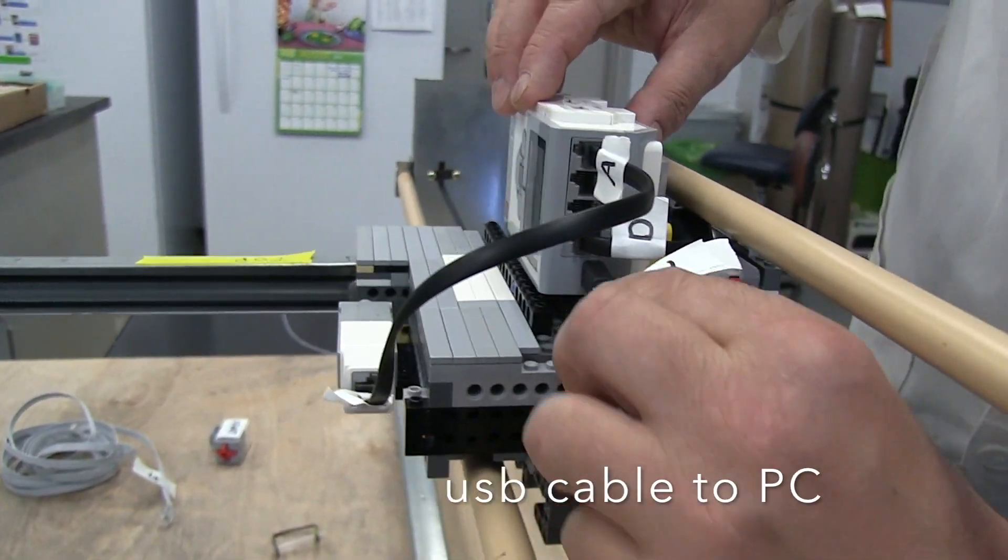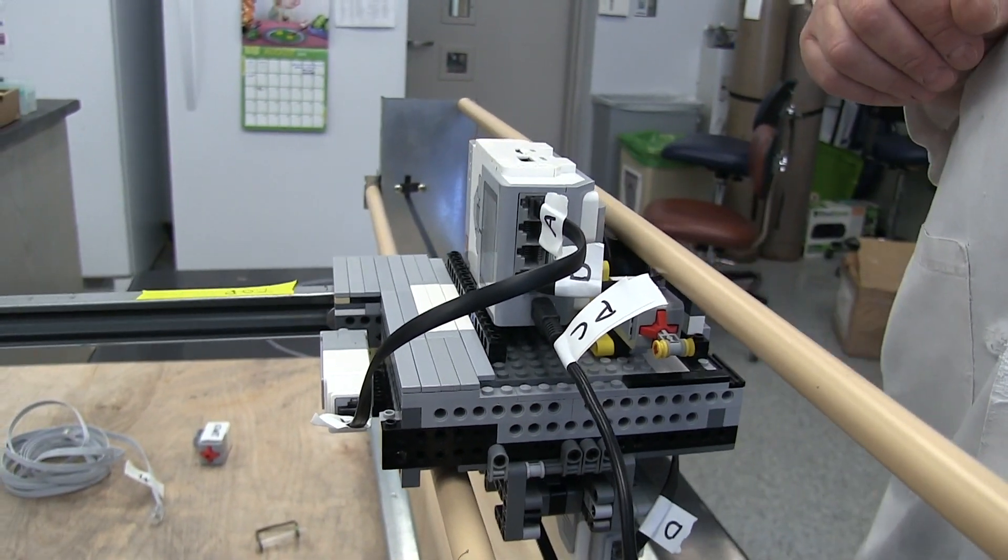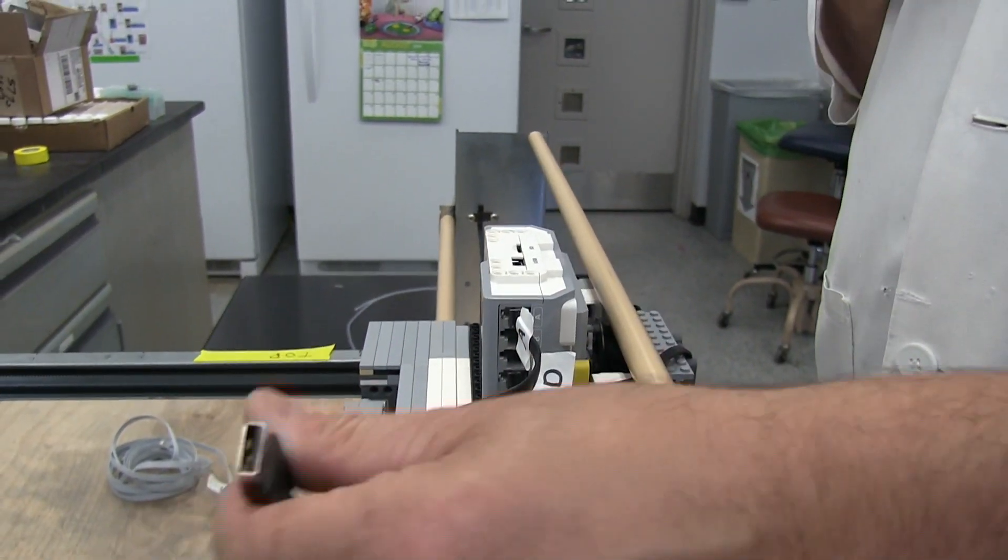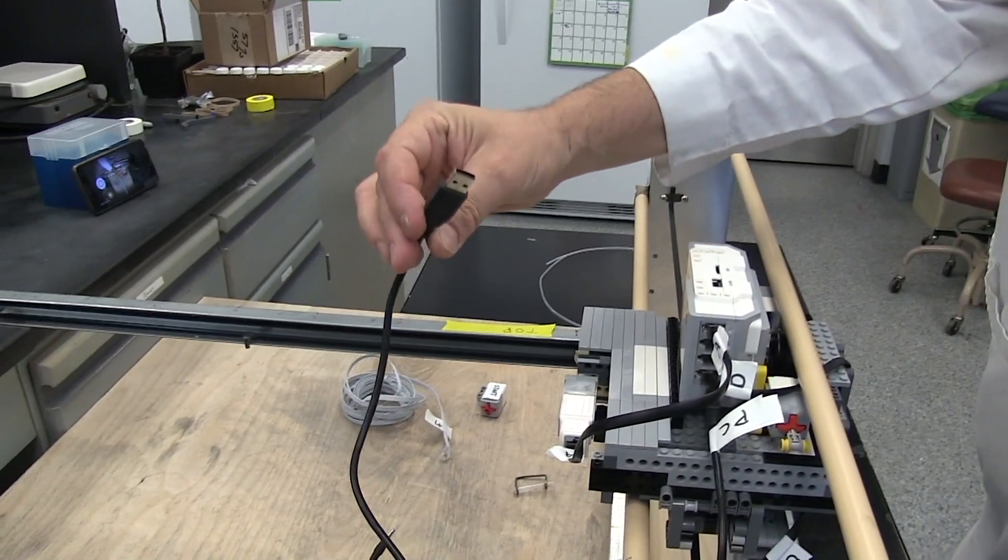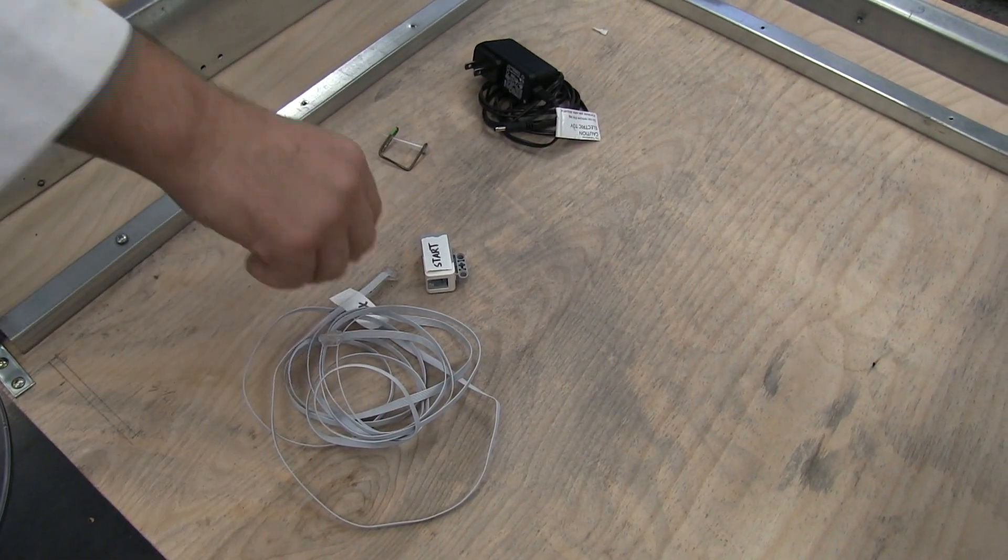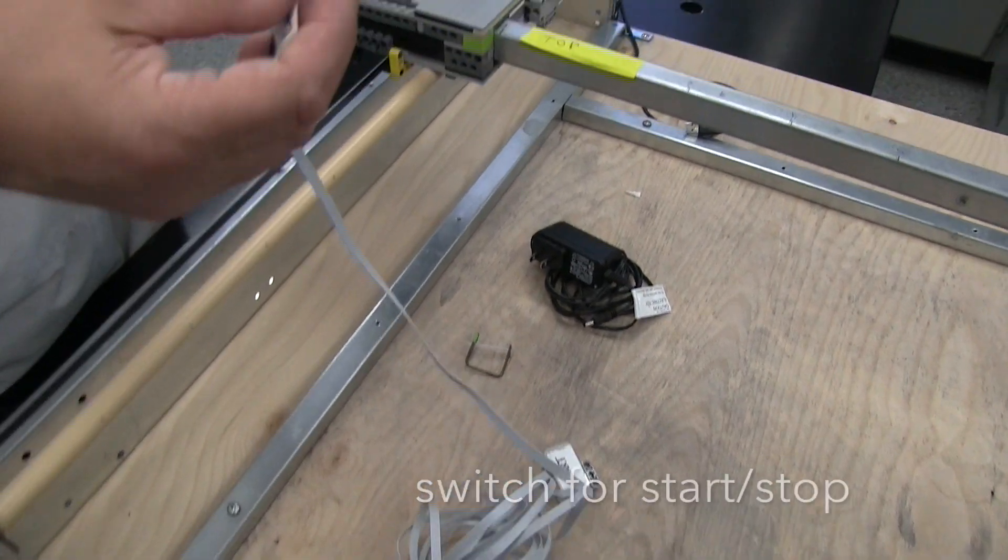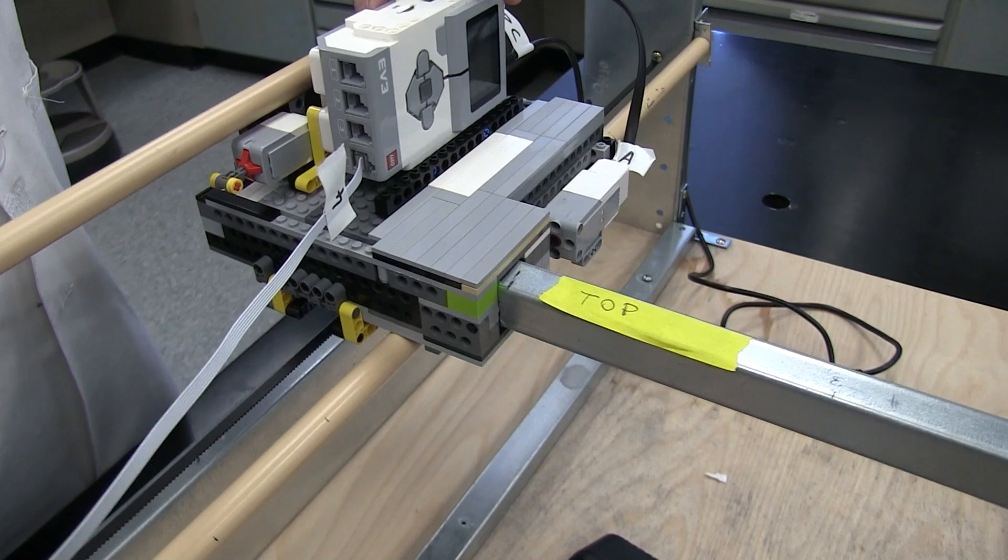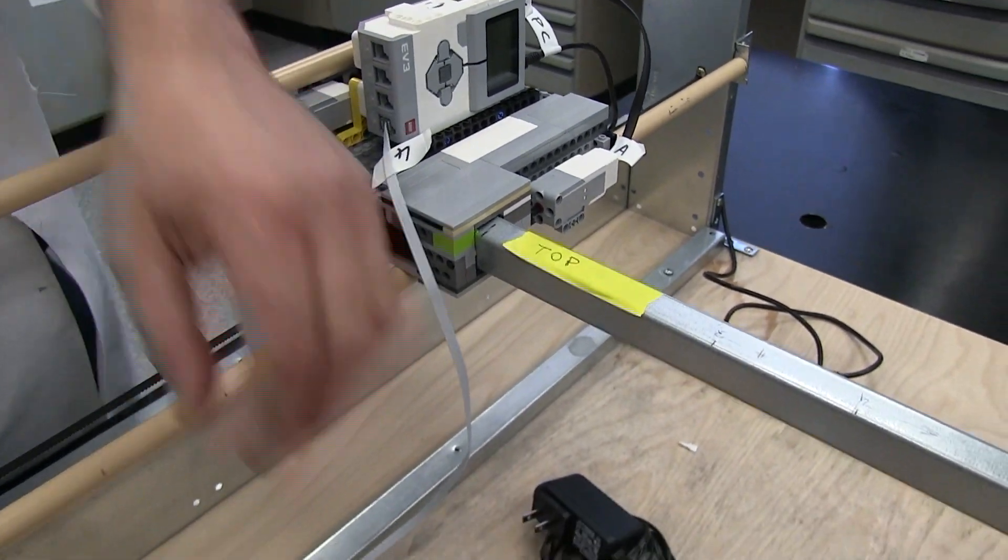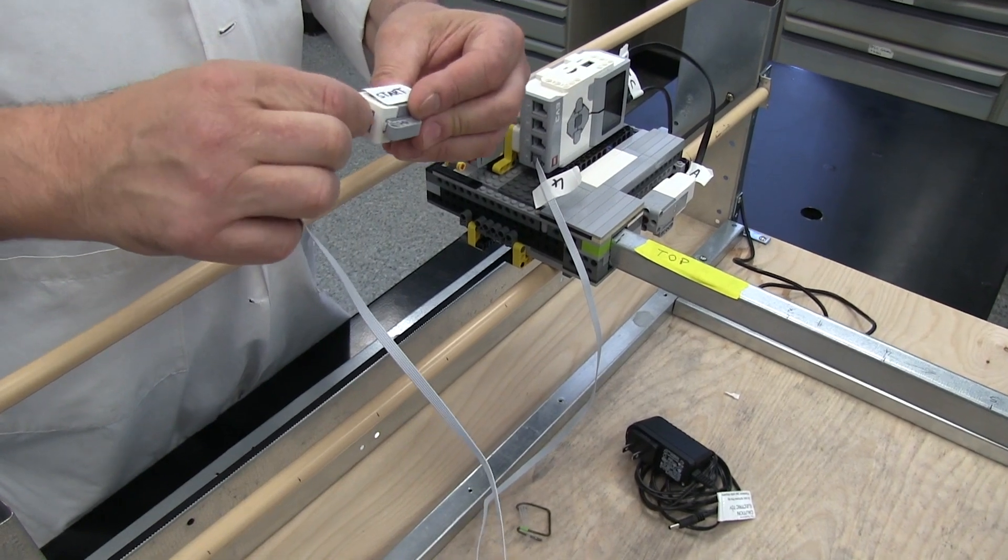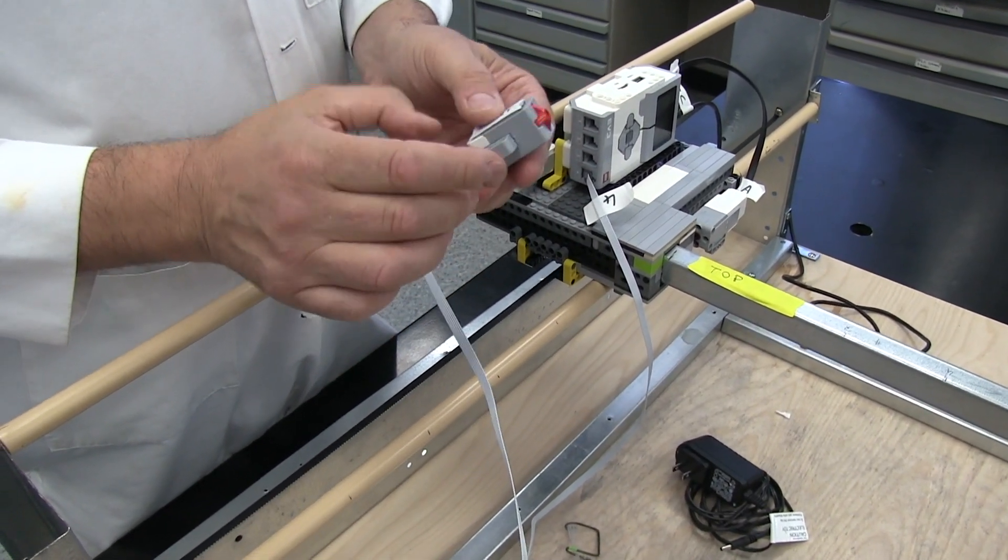The USB cable will now be attached to the EV3 unit and connected to the computer. This will allow for programming of the EV3 unit from the computer. The final cable will be connected to the switch that runs the program and initiates movement of the robotic arm.